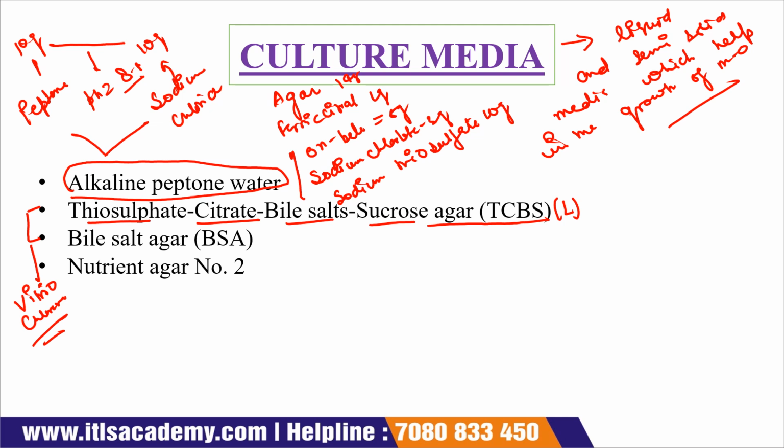Thymol blue 0.04 gram. Bromothymol blue, it is also 0.04 gram.